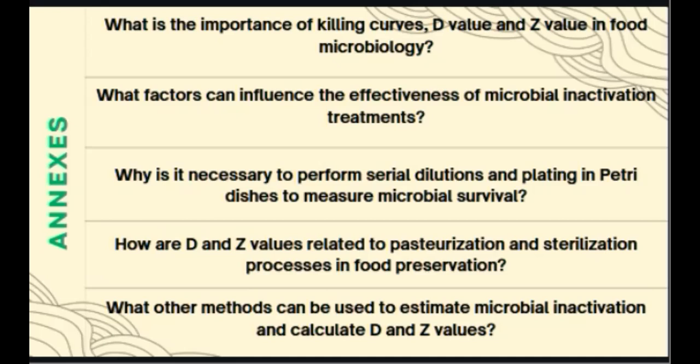Serial dilutions help to reduce the microbial population to a manageable level where individual colonies can be counted accurately. Okay, now Alexis.